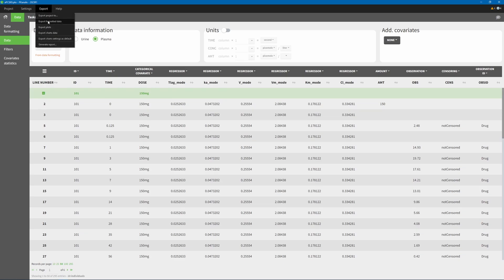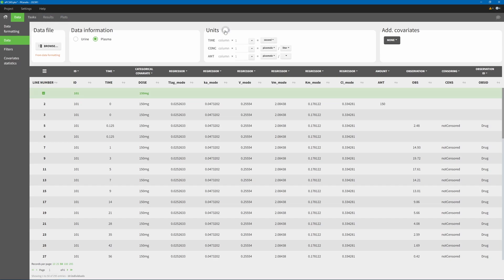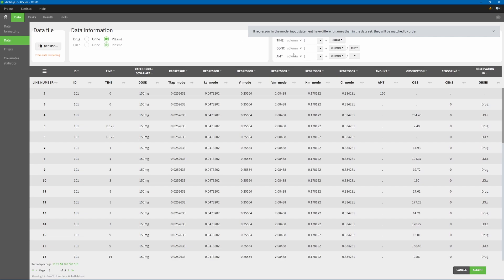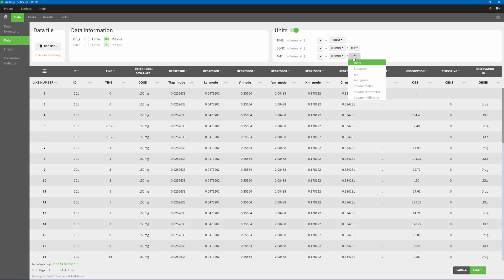Additionally, after accepting your dataset, when defining units for dataset columns, it is now possible to define amount units normalized by weight or area. The units of the NCA parameters will adapt accordingly.